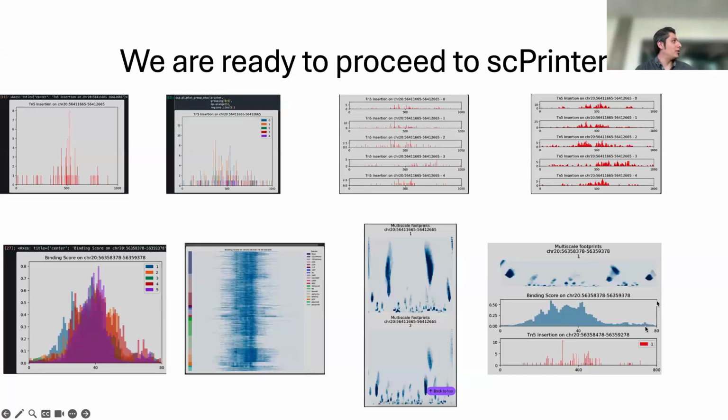So you can imagine this to be like 500 or 1,000 or so different scales that you're getting measurements at, with smaller scales at the bottom and then larger scales up at the top. Or I might have that flipped, but the point is that it goes from smaller viewing windows to larger viewing windows.